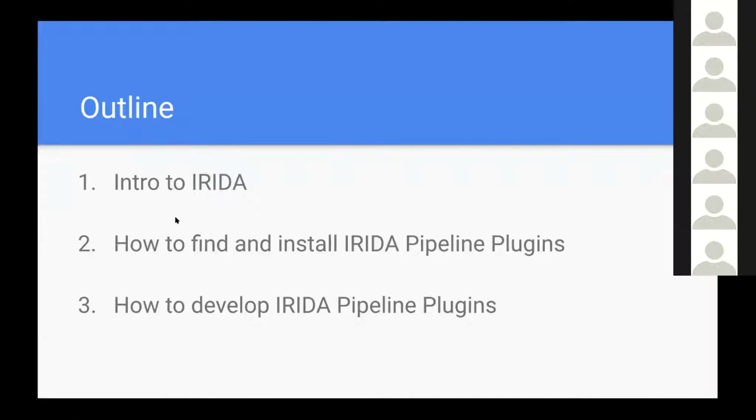And then we're going to talk a bit about how you can develop your own Irida pipeline plugins and how to set up your own development environment to make it convenient to test and develop and break and fix your plugins on your own system without having to interfere with any other existing Irida system that's out there.